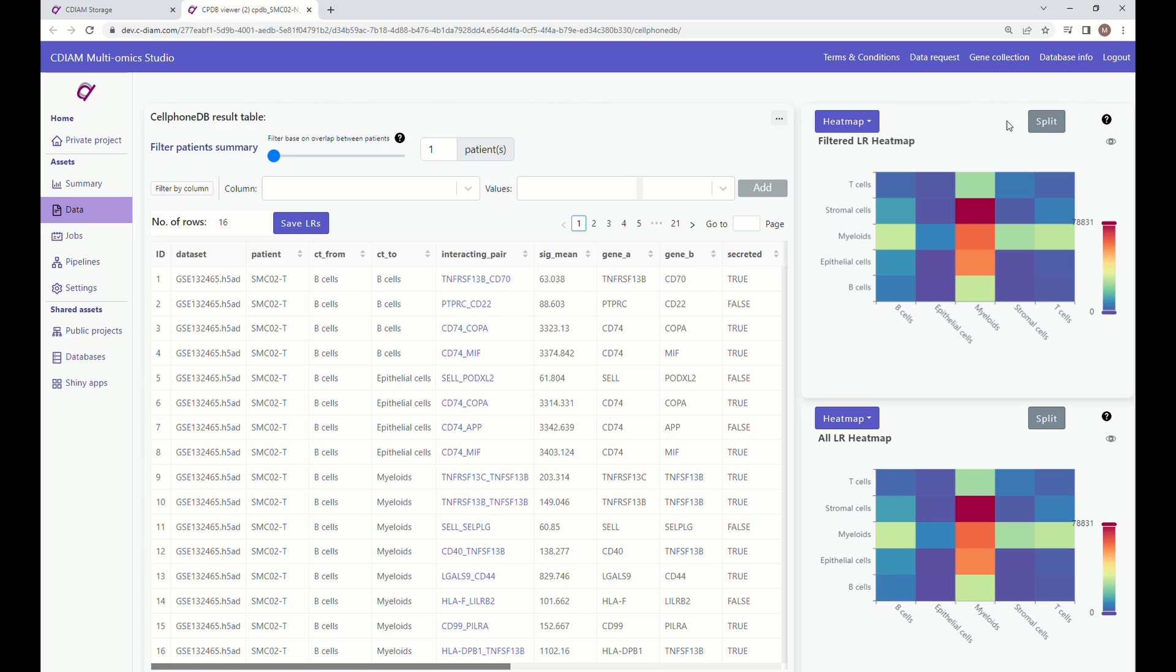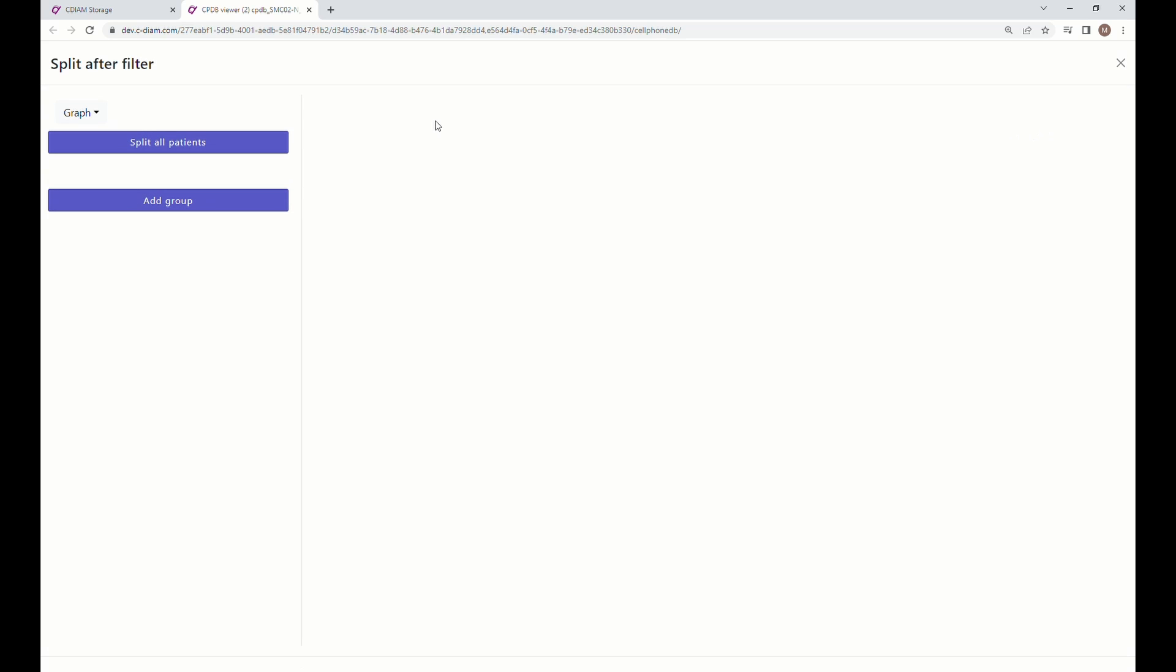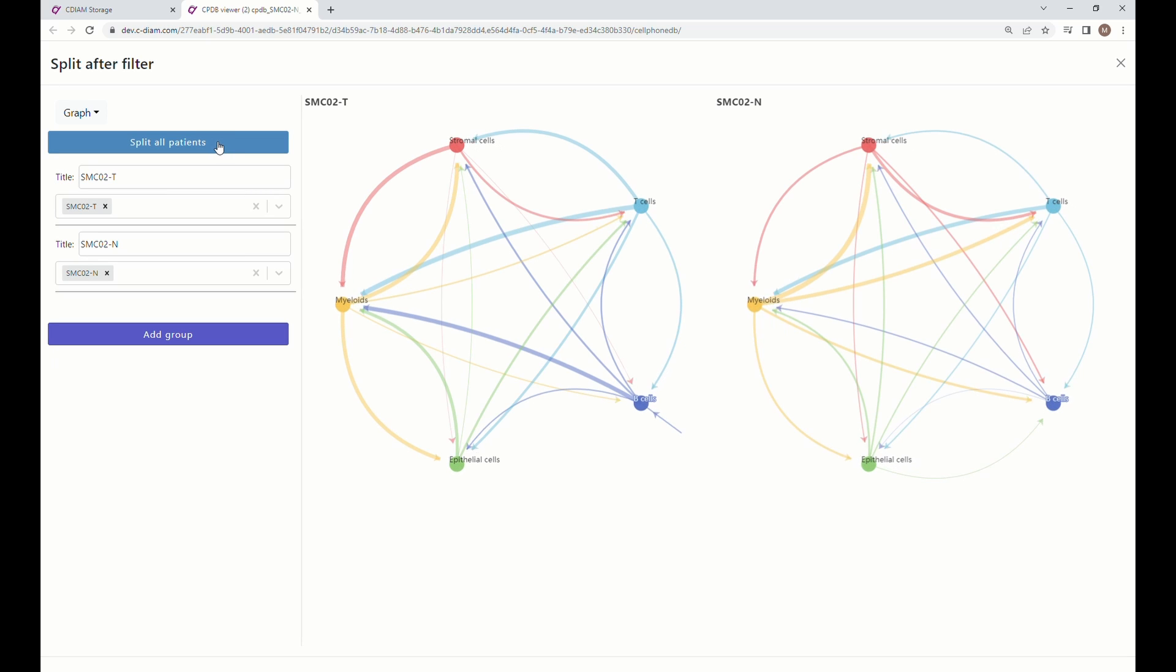When you arrive at the result table, click on the split button. Click on Split All Patients. The app will produce two data visualizations that you can observe.